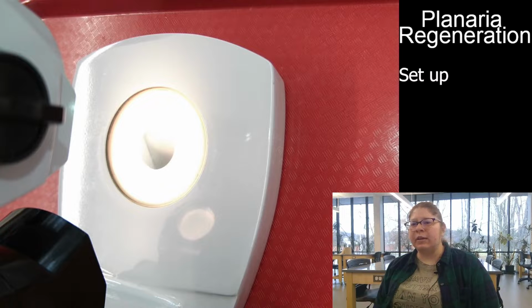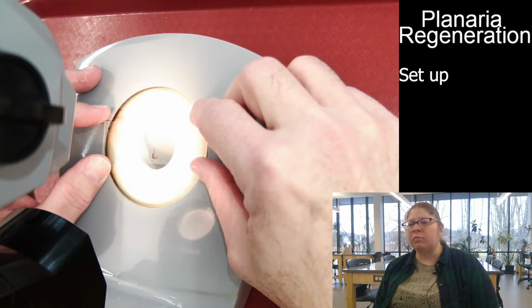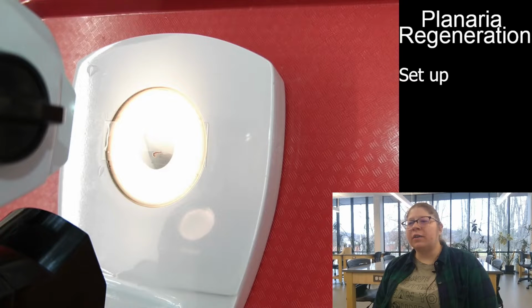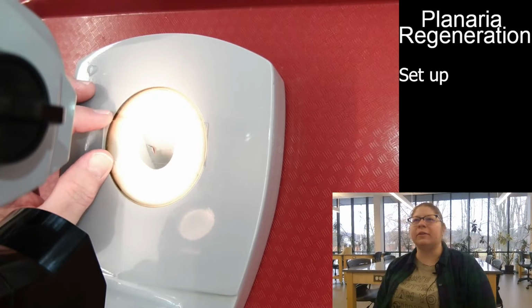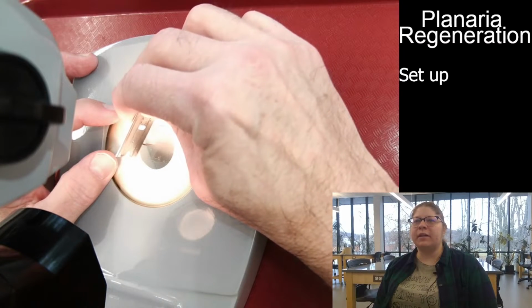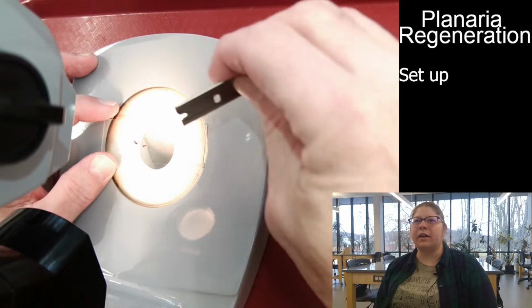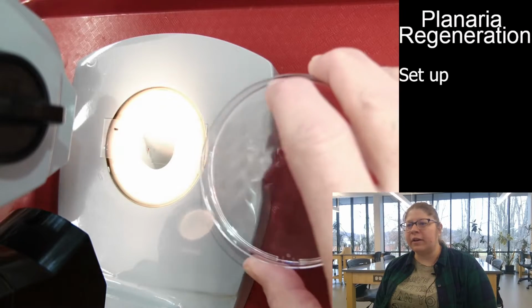The point of it being in the freezer is to keep it very cold, which will partially anesthetize the Planarian and keep it from moving so much. He's got the microscope slide with the Planarian on the dissecting microscope, and you can see it wiggling around a little bit in the center of the slide. He's got a razor blade and he is going to cut it in half. And now you can see there are two pieces and they are both still wiggling independently. They are still alive. This process does not kill the Planarian.